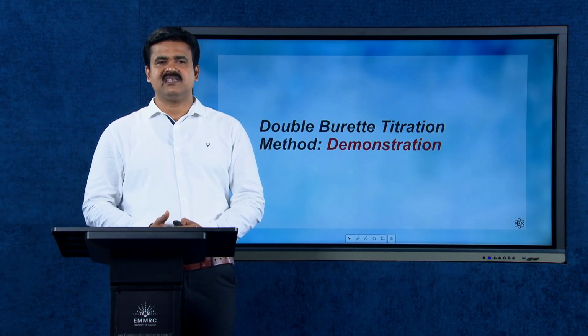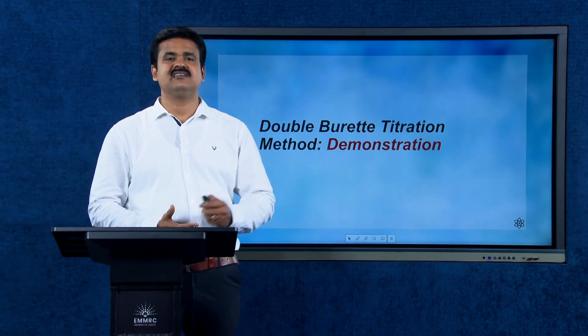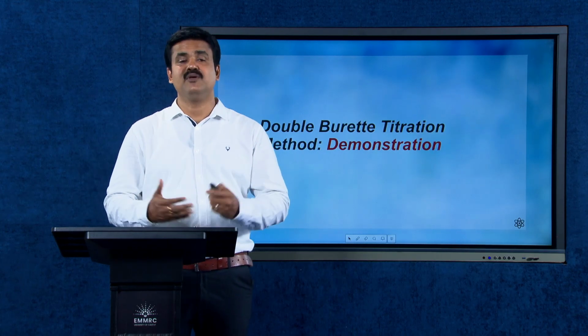Now we can illustrate the same experiment, that is titration of sodium hydroxide with hydrochloric acid, using the double burette procedure.